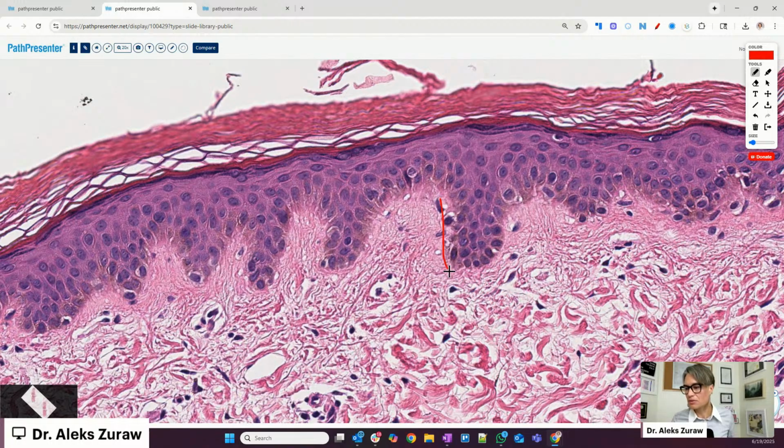And dermis also has different parts. These projections look a little bit like fingers. This dermis here, right here inside, is called papillary dermis, and these are dermal papillae that are integrating with the epidermis. They intertwine so that they stay together. This is made out of different types of collagen, 1 and 3.